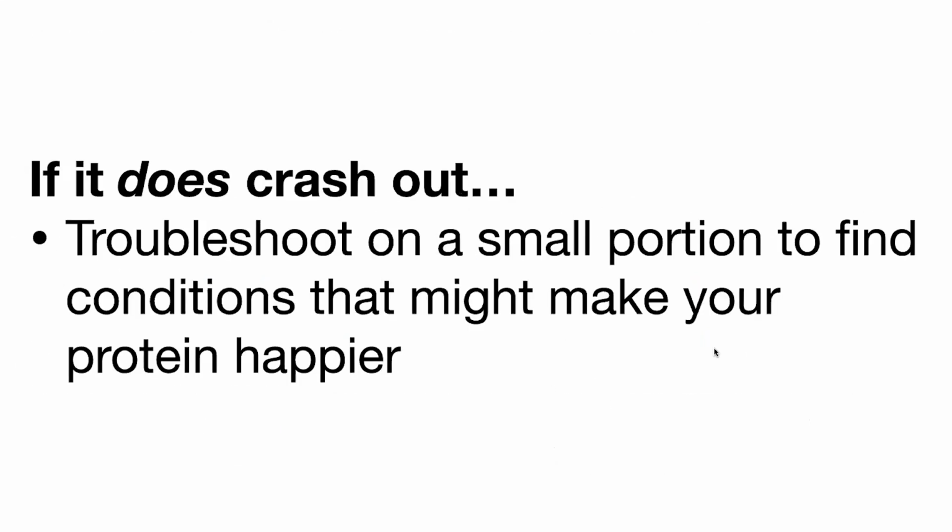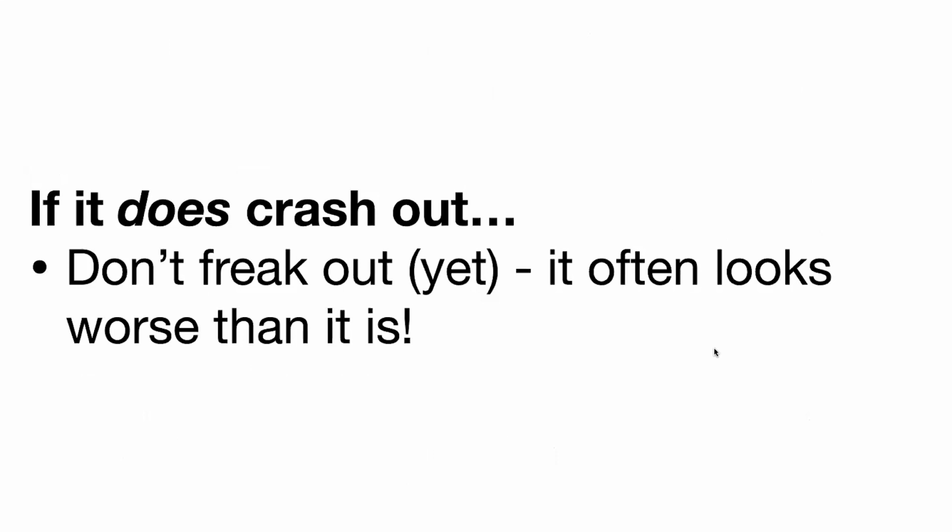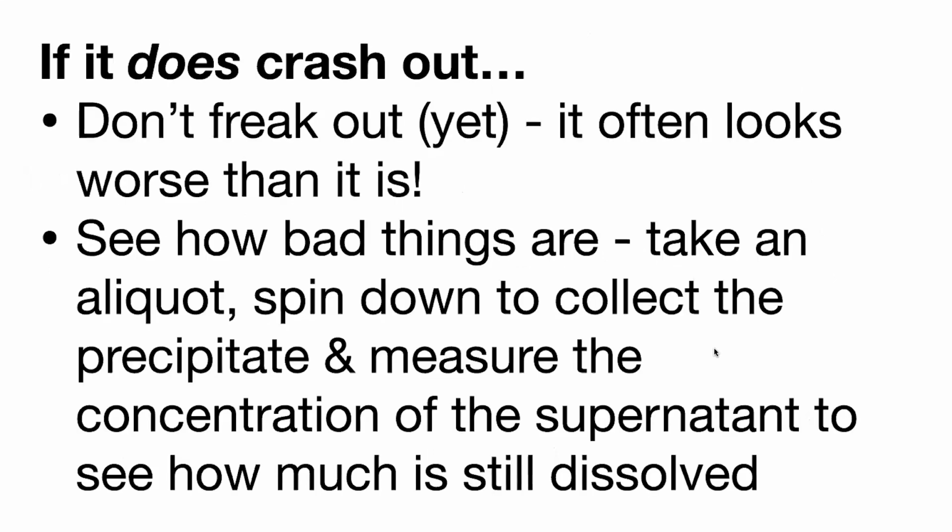Now, say it does crash out. First off, don't freak out yet. It often looks worse than it is. A little bit of precipitate can look really, really bad. A little bit of the protein crashed out can make the whole thing look really bad because the solution gets really, really cloudy and gross.